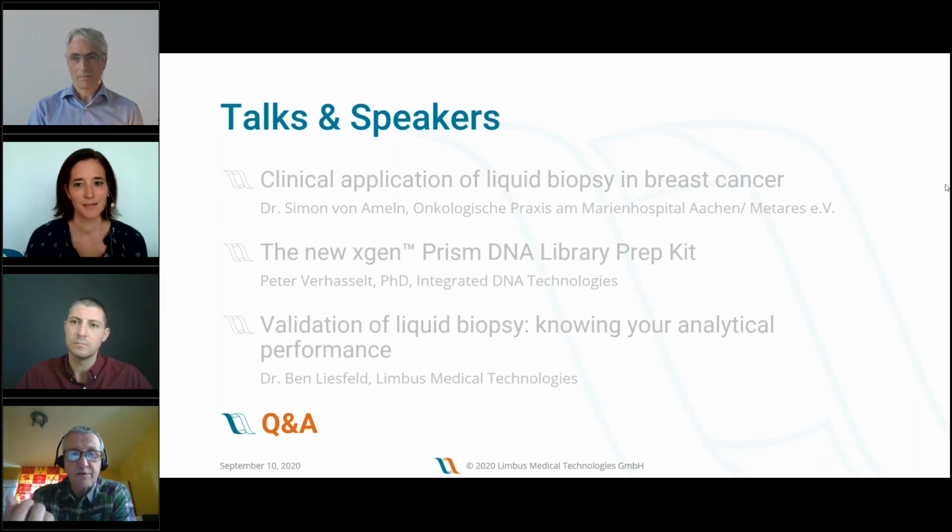The sequencing then starts after the probes are eluted from the captured molecules, and the sequencing starts from the adapters that have been ligated on during the library prep. I hope that answers the question. And we see that in the data, of course. With liquid biopsy samples, if you're sequencing at 150 cycles, we see that we are sequencing into the opposite adapter, but that's a bioinformatics task to take care of.